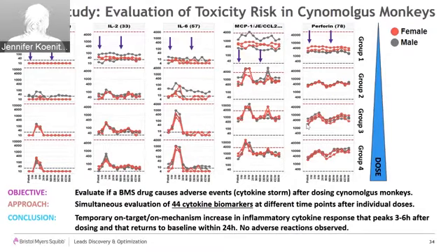Together with other data that was collected from the study, we could conclude that the molecule was well tolerated and did not cause a cytokine storm, which was a particular concern for this particular mechanism of action of this molecule, because we could also, from in vitro data we had previously generated, figure out that these transient cytokine inductions that we see are most likely on mechanism and on target.